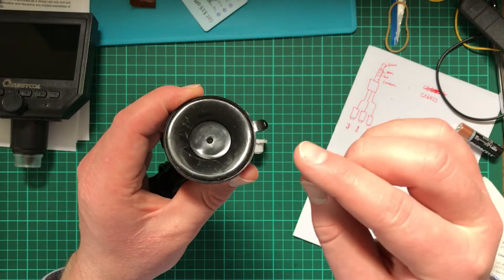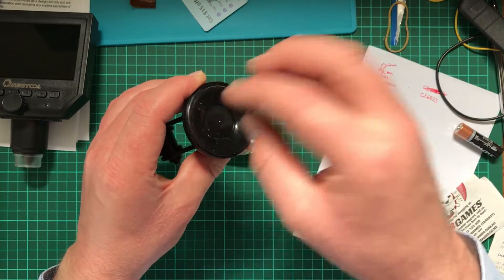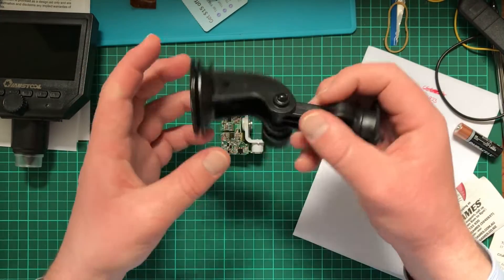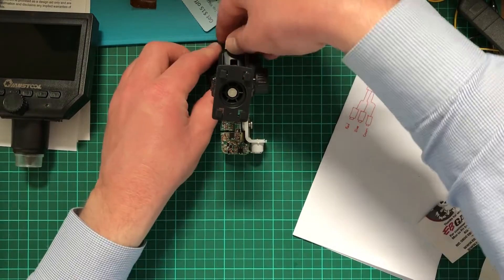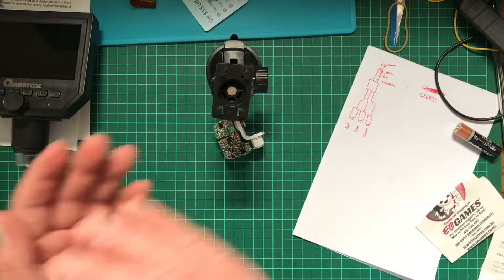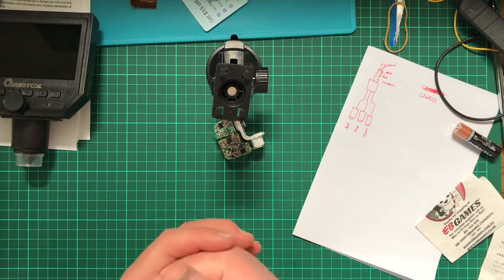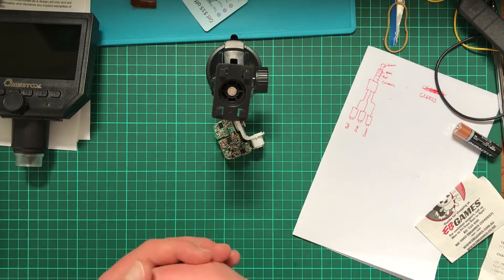I did accidentally put the little cover on here the wrong way and it just tore to pieces, so that's something you're going to want to keep an eye out for. But I have noticed it will generally stay in place. For someone wanting to do work professionally, I wouldn't recommend this as the go-to thing, but it's okay as a backup.